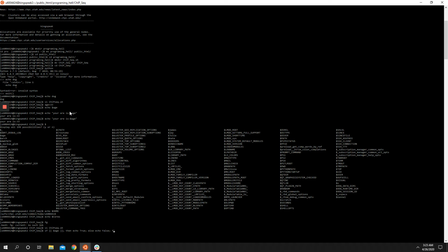So this is just a simple if statement, which we'll go into in a second, that basically says if this is set to something other than nothing, then echo true, else echo false. So we set it earlier, and so we know that's true.